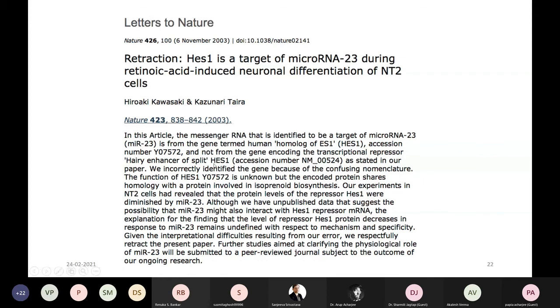So whenever you are analyzing, since there will be so many target proteins, maybe 100 or 500 or 600, it won't be possible for you to manually go and check. Ideally you should, but if you want to skip that step altogether, please stick with an ID that is quite universal, like UniProt.